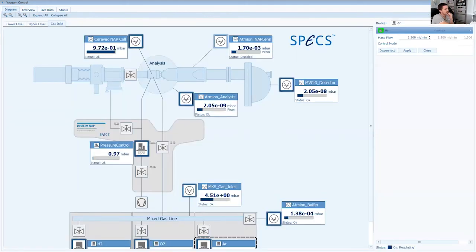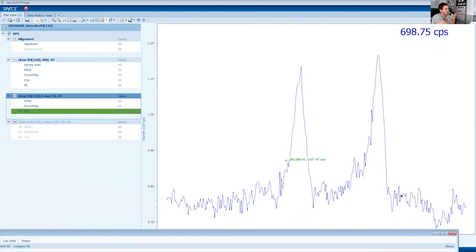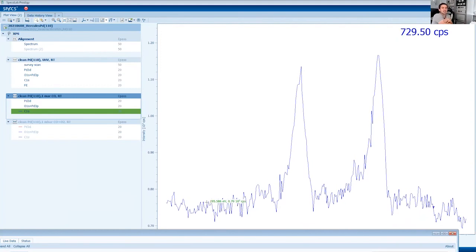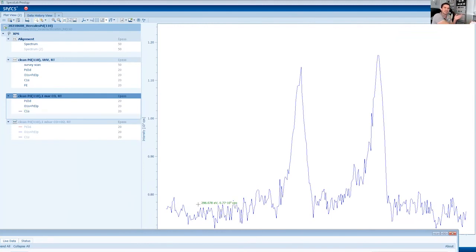Okay, so this is the last scan. We should be a bit quick, so we don't take many scans. Usually each measurement takes from 1 to 2 hours, I mean, to measure one group. Especially the spectra in which we are more interested, we measure with 50 or 30 scans and so on. It takes quite a long time to measure everything.